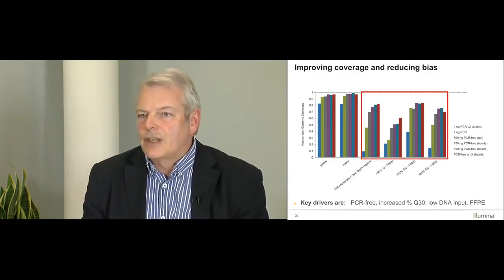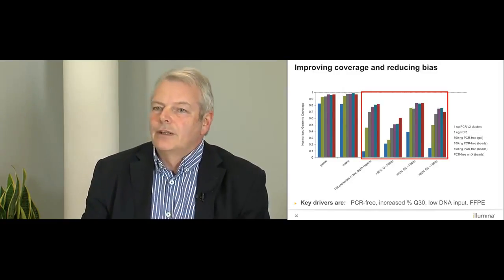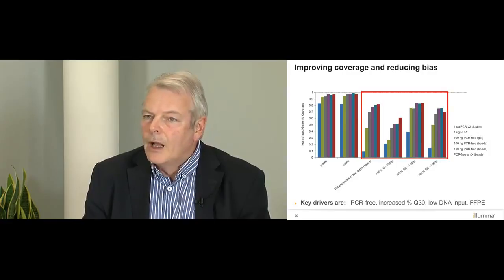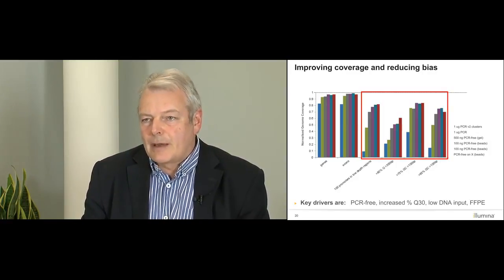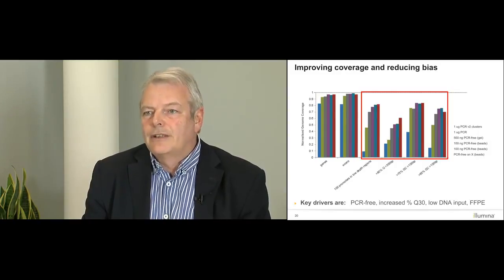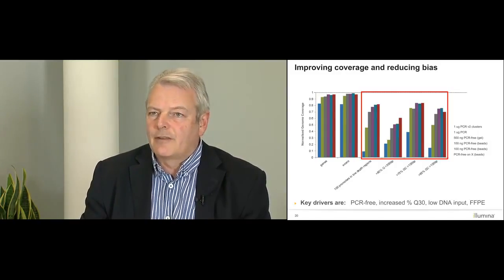Promoters are GC-rich, but we really want to see promoters. And you can see how far we've come. Key drivers are the PCR-free, as I've mentioned, improved quality of the chemistry, reducing the low DNA input, and I've already mentioned the use of FFPE.